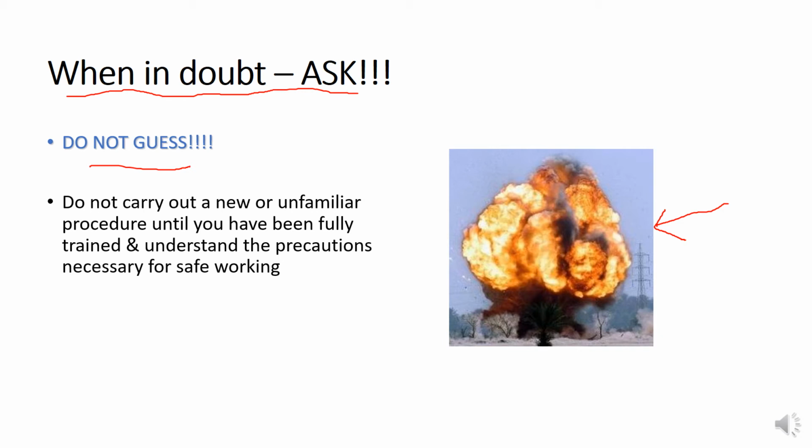If you are going to use anything that you are in doubt about, or you are not sure what its function is, for example, this slide is not only about chemicals. If you are in doubt how to run this equipment, or this machine, please don't touch it, because this is dangerous for your health, and it is also not good for the machine or the equipment. So first get a training, basic training.